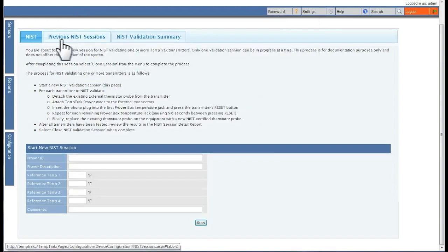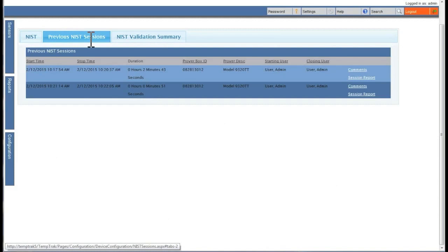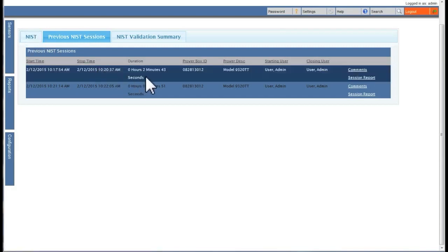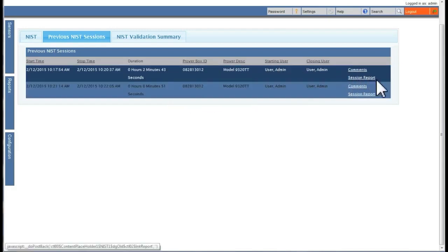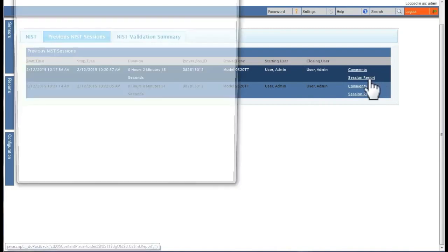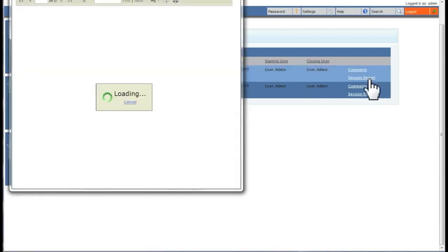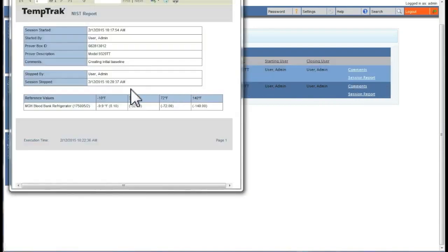The previous NIST sessions tab displays a list of all NIST validation sessions which have been performed. This list shows when sessions started and ended, what Prover box was used, who started the session, and more. Here, you can pull up the session report for a previously completed NIST validation session.